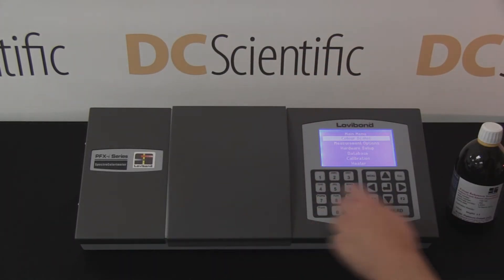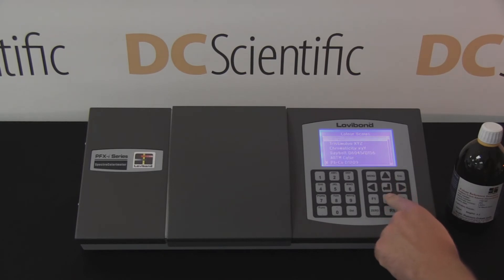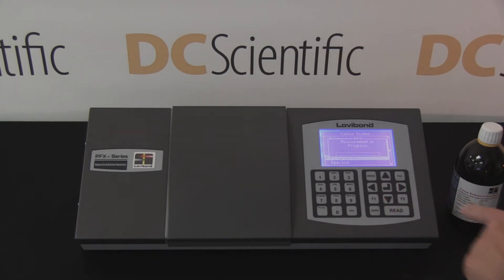The technician selects the appropriate color scale, ASTM D1209 for Platinum Cobalt color, and presses the read key.